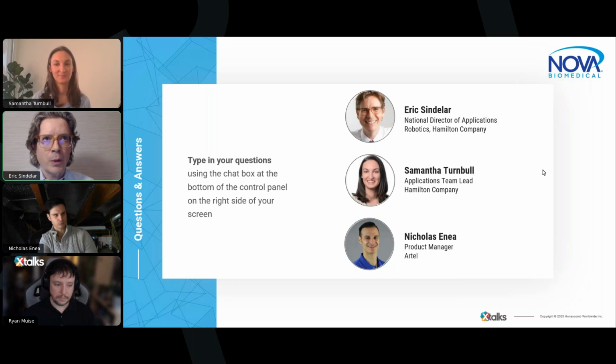But for our platforms, know that when you install the software, it comes with a liquid class database that has liquid classes predefined for all different sorts of liquid types. So you already have something to start with, and along with the proper method settings and labware settings that Samantha covered, you're going to be in the ballpark of achieving a proper liquid transfer.